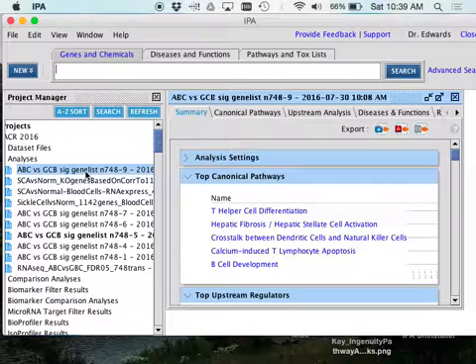Picture all 30,000 human genes as green balls. Say I have a pathway, and there are 40 members in that, 40 pink balls. In our gene list, we have 748. So I get 748 draws out of those 30,000 balls. What are the odds that I get 1 pink ball, 2 pink balls, 3 pink balls? The more pink balls I get, the more that's not an accident. And we can define these relationships any way we want.